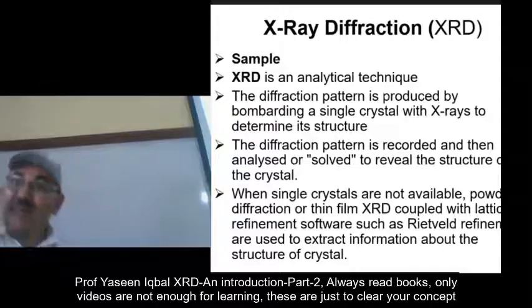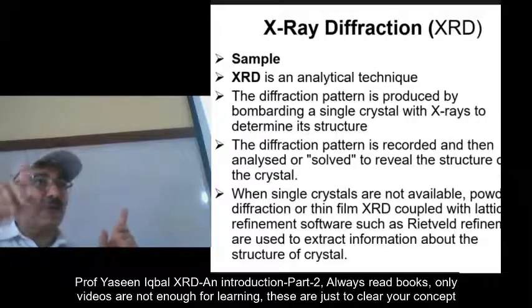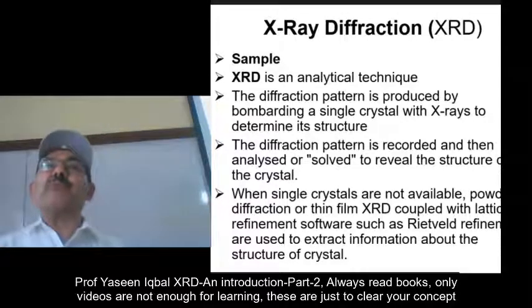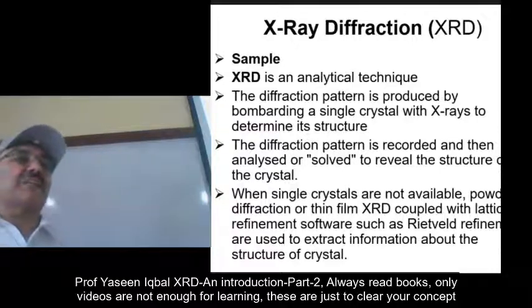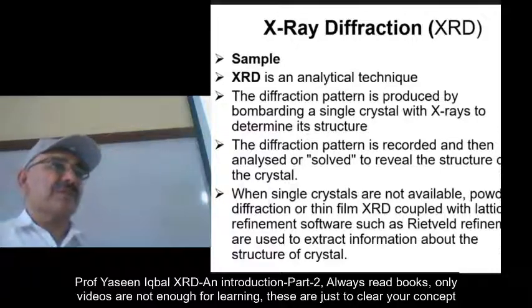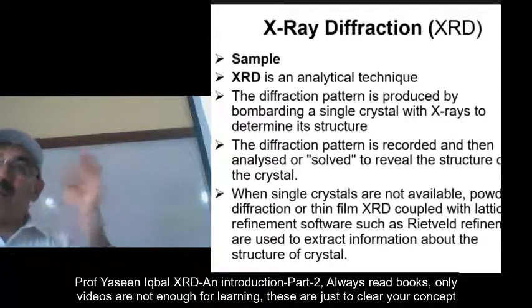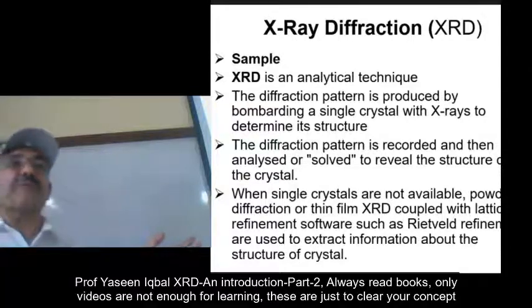The environment in the X-ray sample holder place where you put the sample should also be very clean, because you are dealing with particles of the dimensions of angstroms, and there may be something in the environment which can contaminate your sample. So you must be very, very careful.